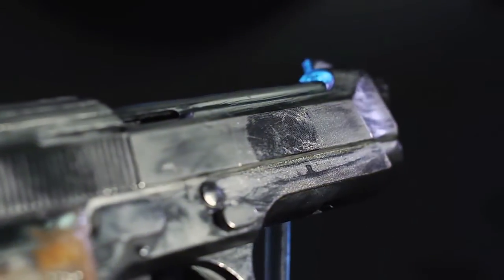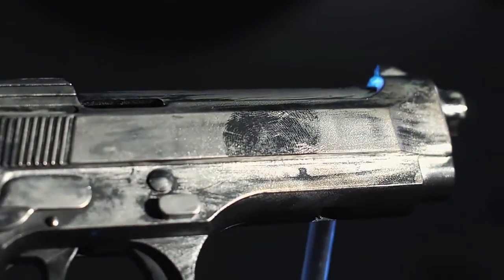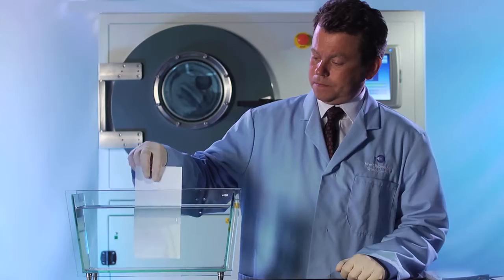Unlike the superglue method, VMD doesn't gum up articles like firearms, so they can still be sent for subsequent ballistic tests. It's also been possible to detect fingerprints on articles many years after the crime, and even after prolonged immersion in water.